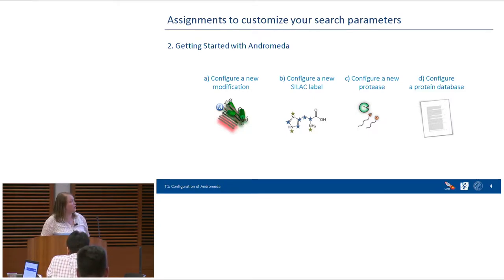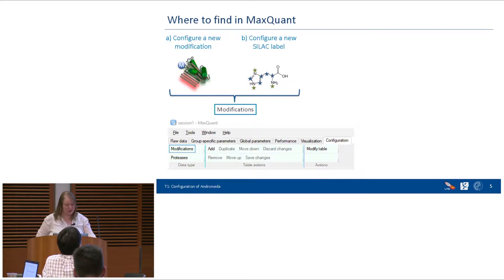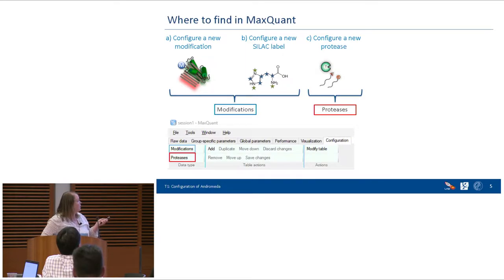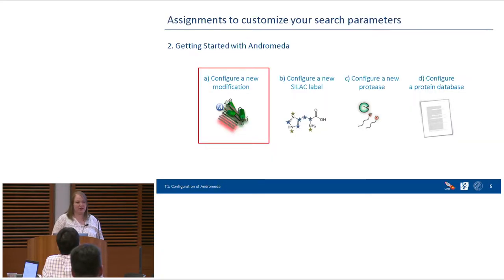We are going to configure a new modification, a new SILAC label — histidine 8 — a new protease, and then a database. As a quick overview of where to find these in MaxQuant: modifications and labels are found in the Configuration tab at the very end. For proteases it's the same — Configuration, then Proteases. For the database, go to Global Parameters and then Sequences.